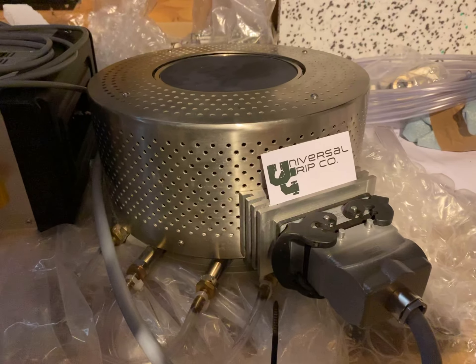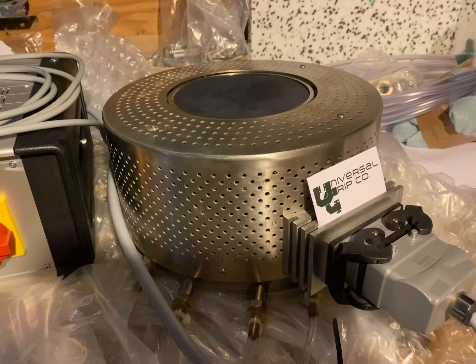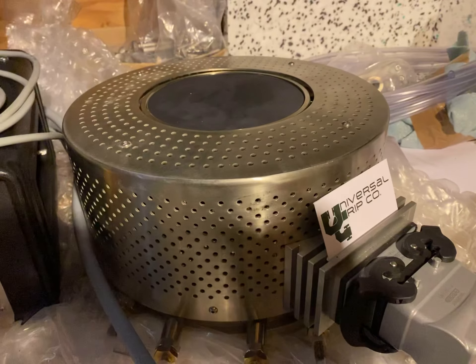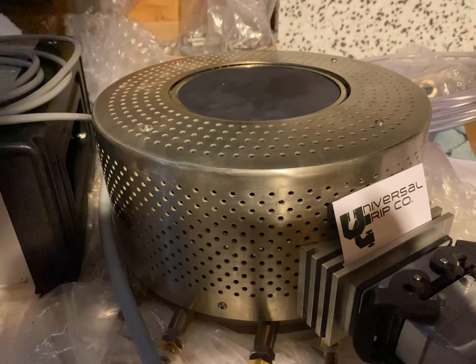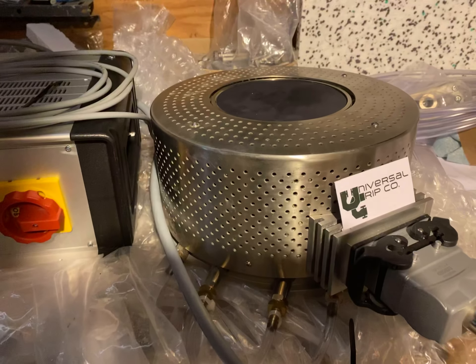Hello everyone. Today we're showing our heated compression platens. These platens can be set up to go up to either positive 650 Celsius, or we can also make them to do cooling as well, based on the Peltier effect, down to negative 30°C.